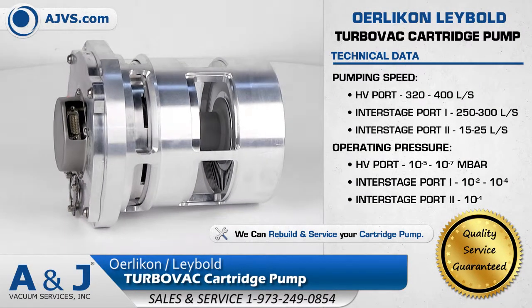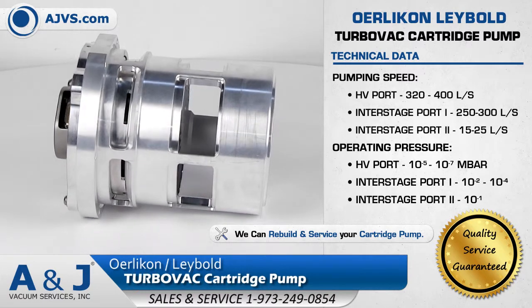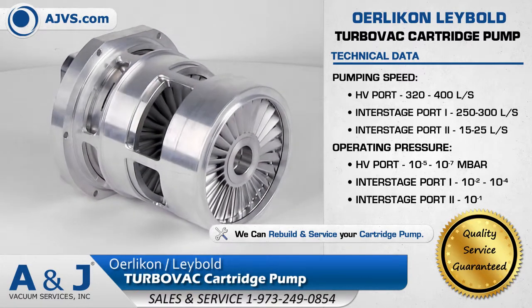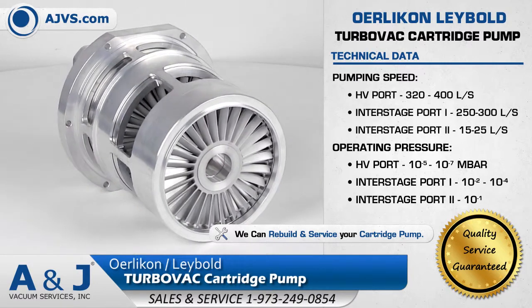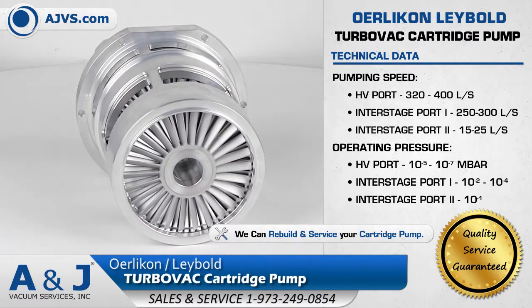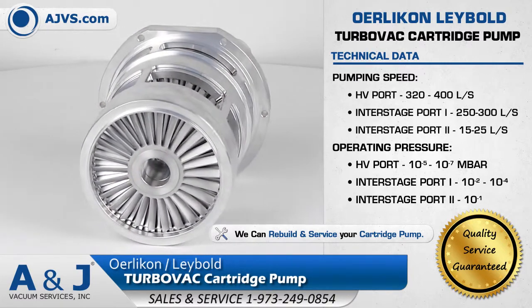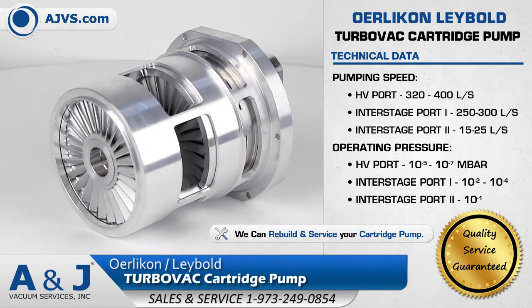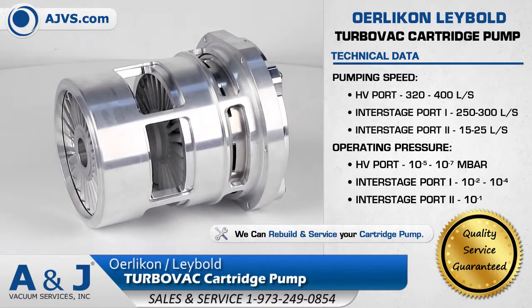The Oerlikon Leybold TurboVac Cartridge Pump is a compact turbo molecular pump designed to be integrated into analytical instrument systems. The TurboVac Cartridge Pump is offered in dual inlet and triple inlet configurations, and up to three analysis chambers can be evacuated simultaneously by a single multi-inlet pump.